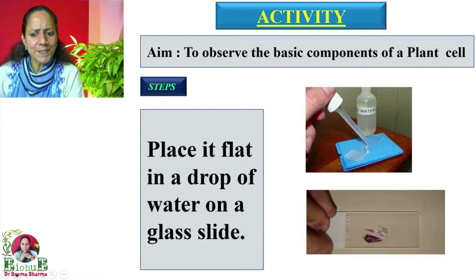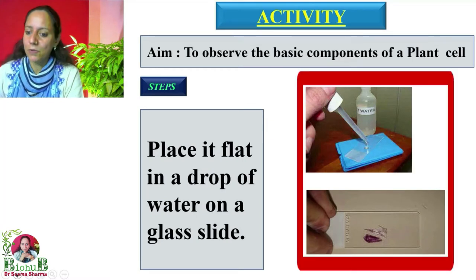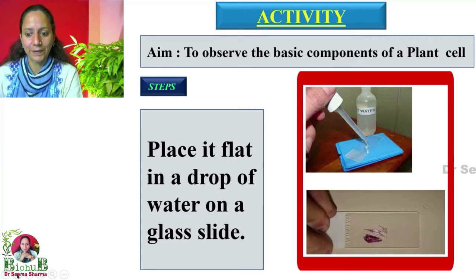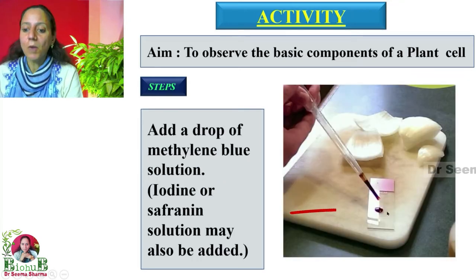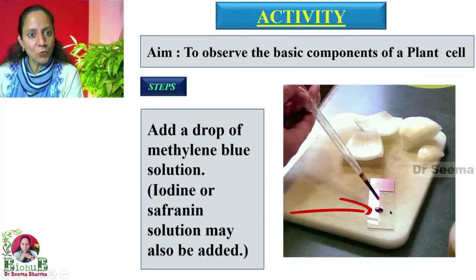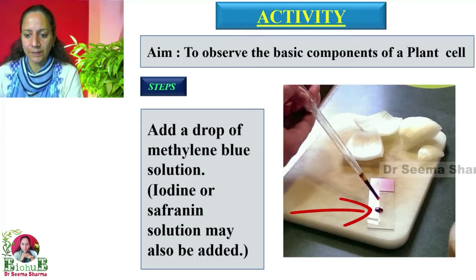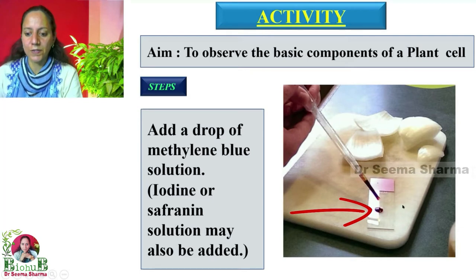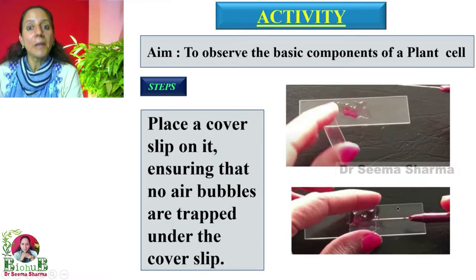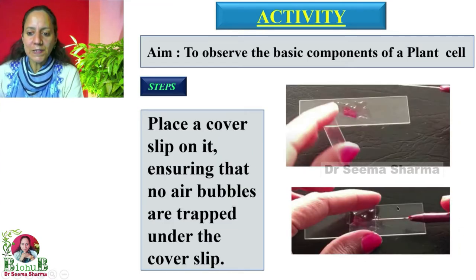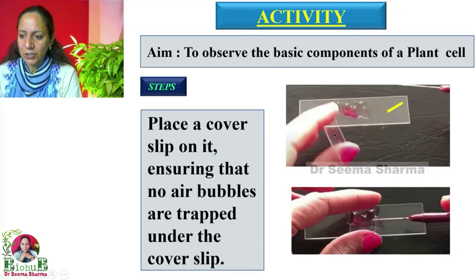Step three — place it flat in a drop of water on a glass slide, as shown here. Add a drop of methylene blue solution or safranin — in my case I have used safranin solution. Then place a cover slip on it.